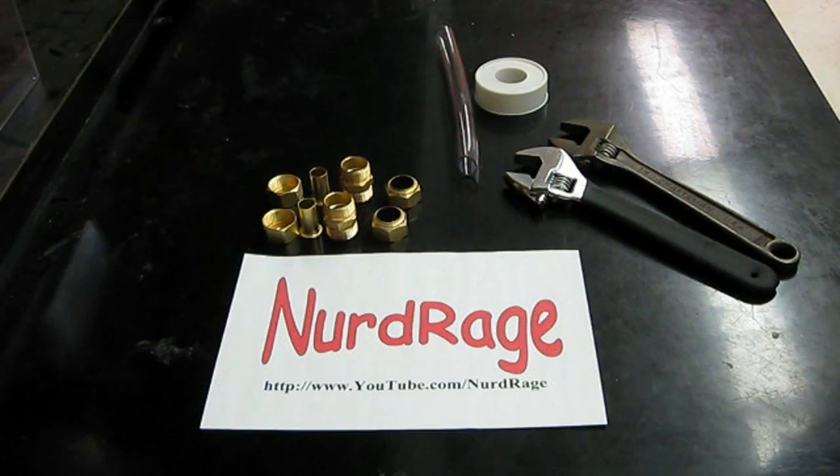Hello fellow nerds. In this video we're going to make a complete refillable glow stick.